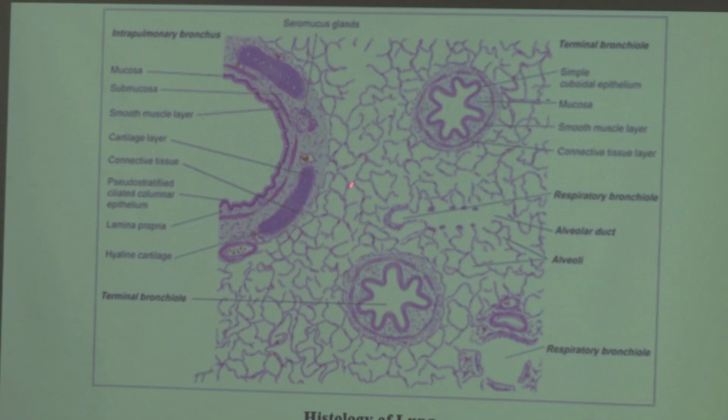So these portions, the empty portions, these are alveoli. Okay, and these are the alveolar septa, separating the adjacent alveoli. Now here what you have to identify, mainly, is the simple squamous epithelium. In the alveoli you have to identify the simple squamous epithelium.